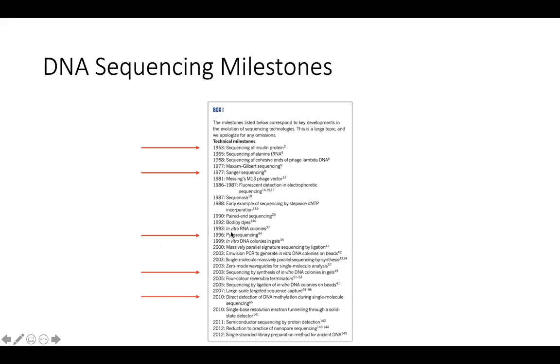And then after that, we have the beginning of the technology that is the major technology available for sequencing today. This is also called next generation sequencing. A more technical way to refer to this sequencing is sequencing by synthesis. And this relies a lot on the mechanics of PCR that we'll discuss today. Here, basically, I'm talking about the Illumina sequencing technology. And the Illumina sequencing technology probably is used by 90% of the sequencing market.